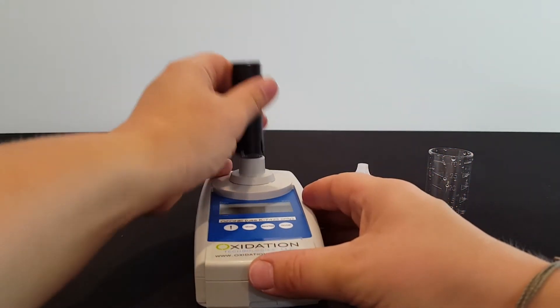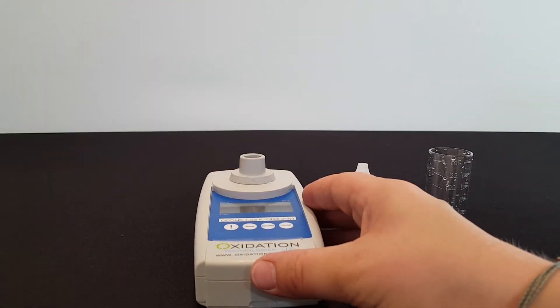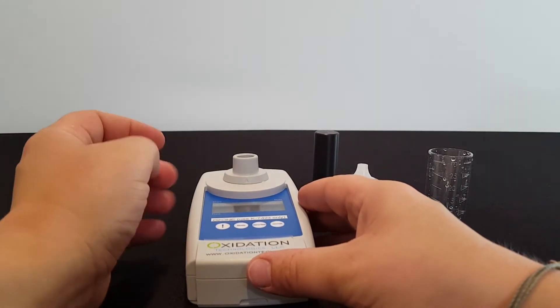It is now ready to be used for the dissolved ozone test. So I'm going to remove the zeroing ampoule and set that aside. I'm going to keep the light shield out.